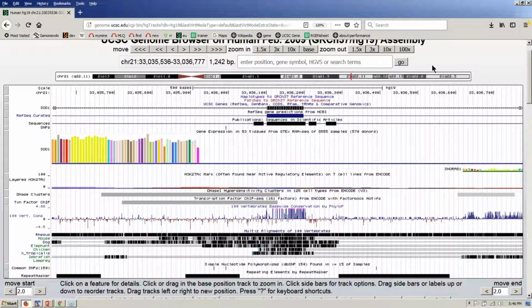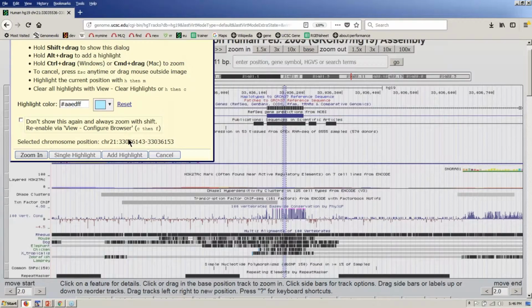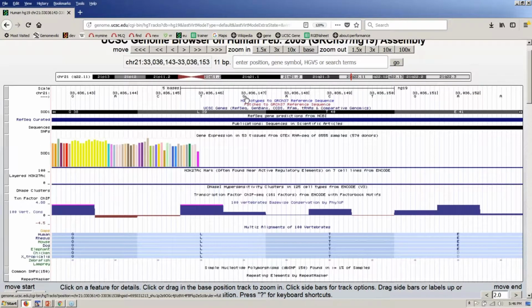So it's a 100 here and 200 there, so maybe we got 30 amino acids, but it's not always obvious what the scale is. If I zoom in even closer to just pick just 3 or 4 amino acids, then we're actually able to show you the number of the individual amino acids. And so here you see we have leucine 39 and threonine 40. You can use the little double-headed arrows at the end here to jump to, as it says with the mouse over, to the start of exon 2 out of the 5, and it'll jump over there.